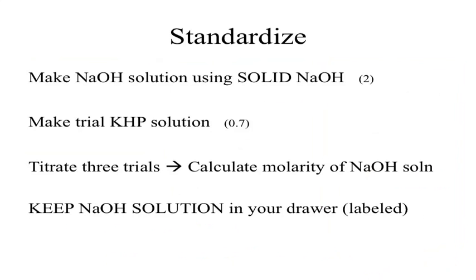your skin. Okay? We talk about concentrated acids and we think of solutions. Most bases are extremely ionic, meaning bases in their most concentrated form are solids. Picking up sodium hydroxide solid with your bare hand is a really bad idea. Please don't do that. Okay? The other issue with it is because it's so concentrated, it does tend to destroy things like the weigh paper.